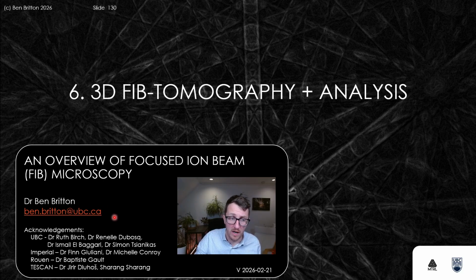This series was created with the help of a range of people at the University of British Columbia, Imperial College London, Rouen, and Tescan. In this lecture, we're going to focus on 3D FIB tomography approaches and analytical 3D FIB. We'll see this for a few different examples in here. I hope you've had a chance to see at least a few of the other modules because they really give you quite a good lead-in and specific challenges that we had to overcome to make this work.